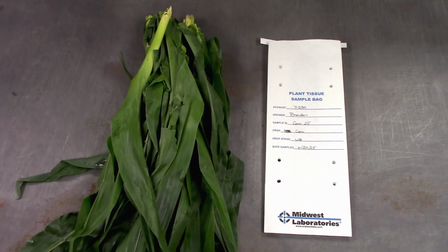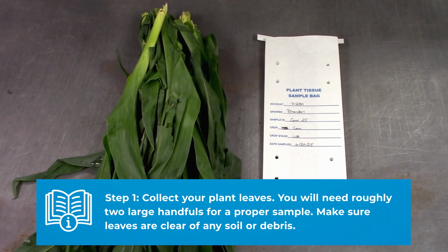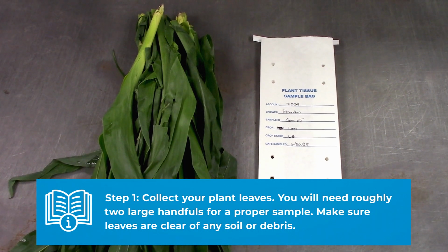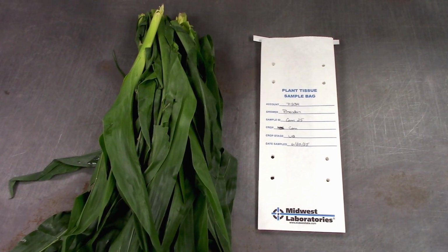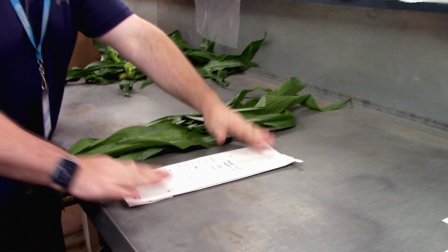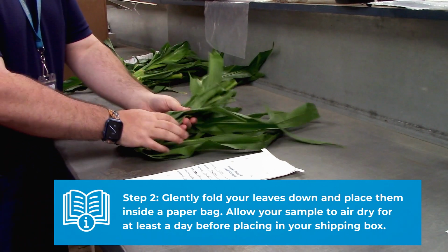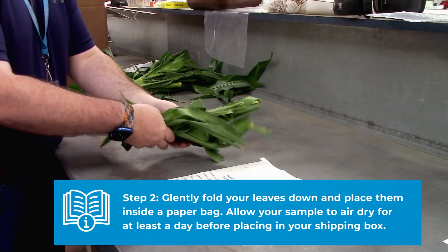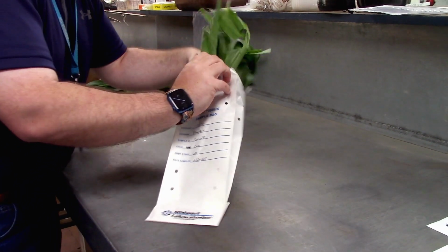So you will want to make sure to use 2 large fistfuls of leaves. Clean off any debris or dirt. So make sure it's just the leaves that you're sending. And you can see here that's quite a large bunch of leaves. So then you'll just roll those up as you see here and kind of fold the leaves over gently, but obviously compact enough to put that into the plant tissue bag.